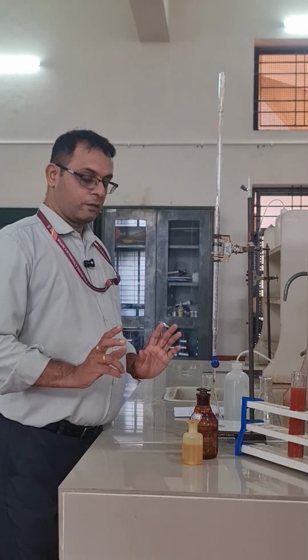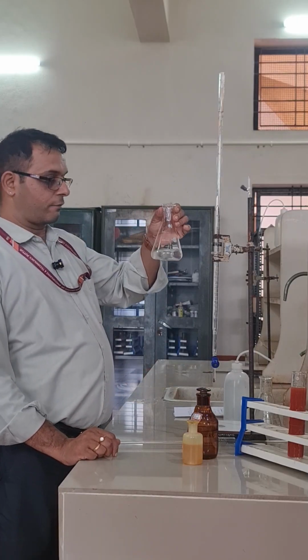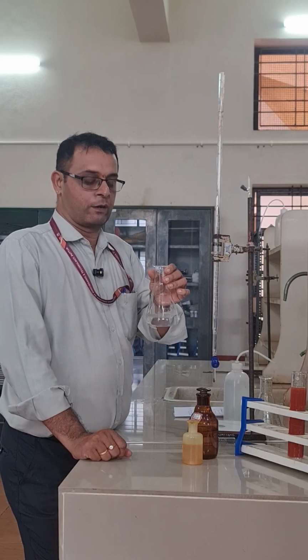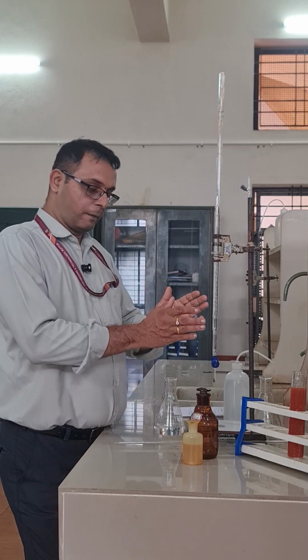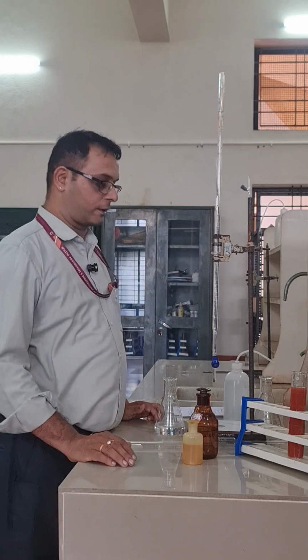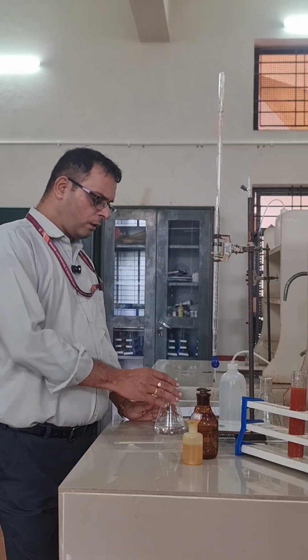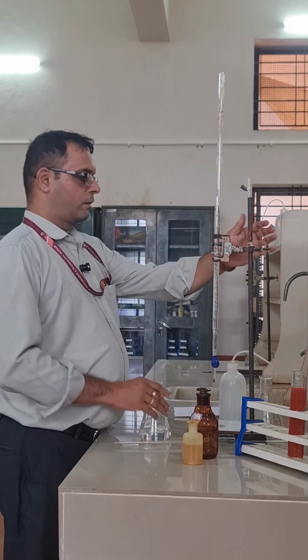Here we have to do two sets. First, we do the test for the sample of water of which I have to find out the chloride content. Then another set, a similar procedure, has to be repeated for the distilled water, right? So I will take 25 ml of sample.